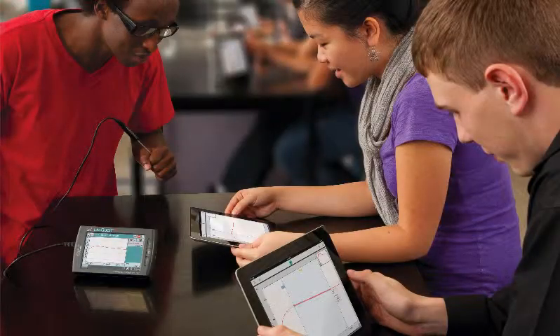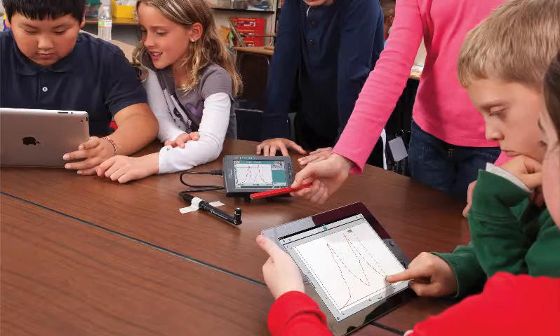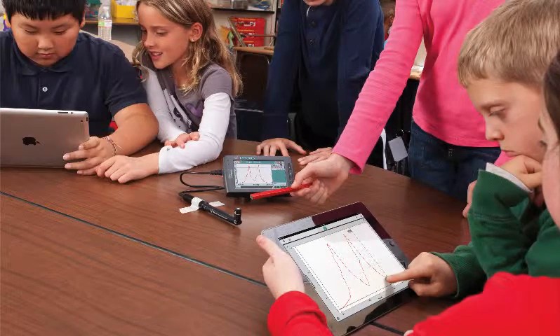Graphical Analysis is an iPad application available for purchase from the Apple App Store and is the preferred way for iPad users to interact with data from Vernier's sensors.